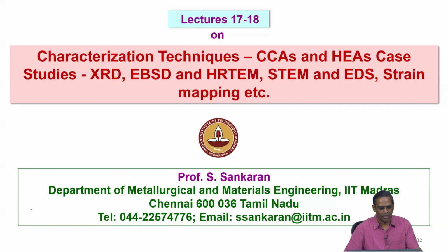Then what is it that we have to think about when it comes to characterization of high entropy alloys? That is a question I first want to pose before I discuss anything. All these characterization techniques we know. And the interesting point is most of these compositionally complex alloys or high entropy alloys form simple phases like FCC, BCC and HCP. As long as they form simple phases, these characterization techniques will also be useful.